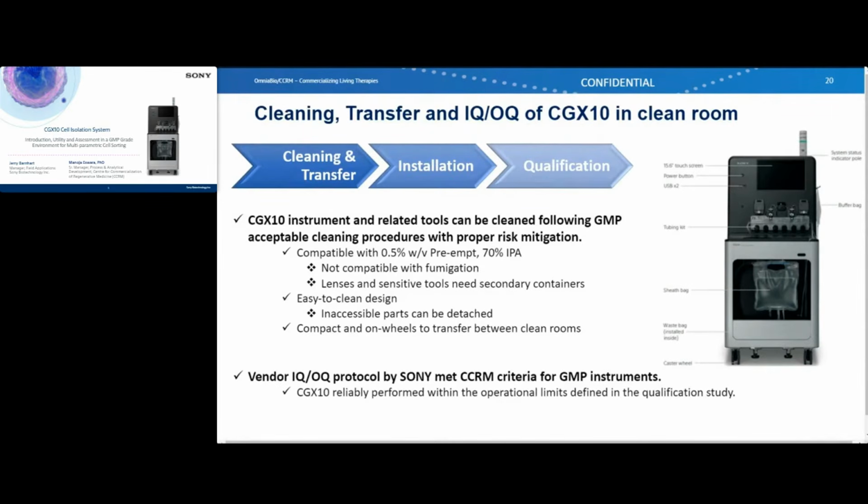In the next task, once it was transferred and installed in the clean room, CCRM performed assessment of the vendor IQ/OQ protocol. This is important because all equipment that supports batch manufacture, which have an impact on process parameters and product attributes, must be qualified before they are used for GMP manufacturing.